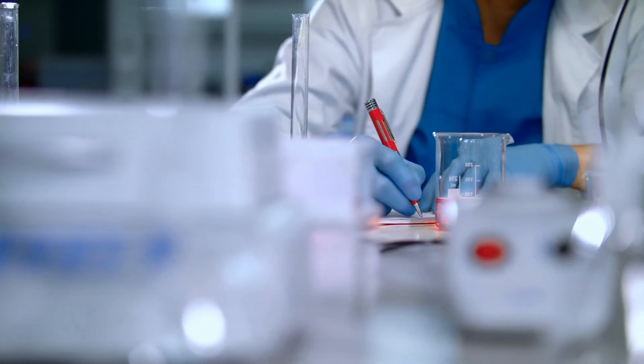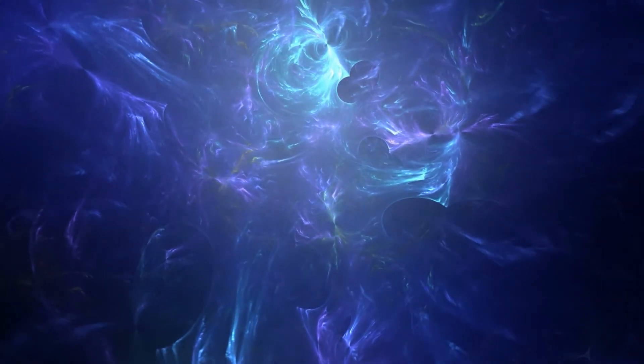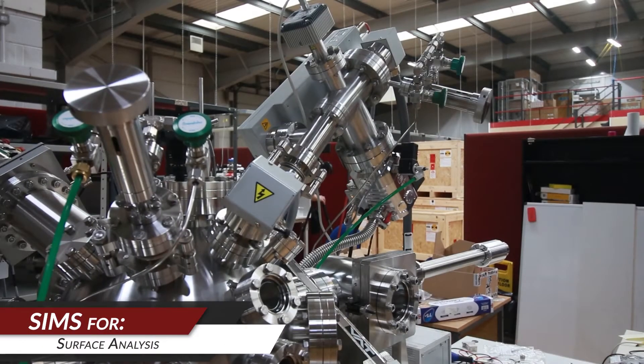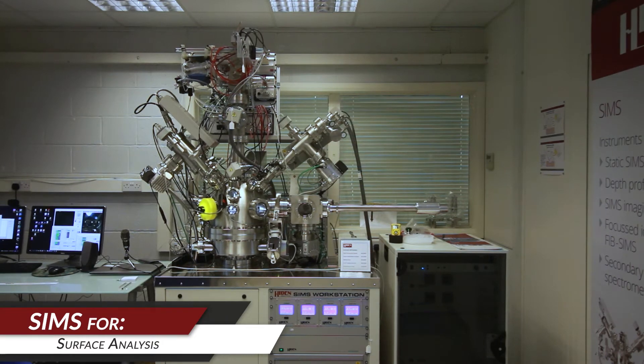SIMS is secondary ion mass spectrometry and it actually allows us to do mass spectrometry on a solid material. So normally we'd be doing mass spectrometry with a gas or a finely divided material entered into the vacuum. Here we can put a solid sample into the vacuum and actually measure it. So we fire a beam of ions at the sample.